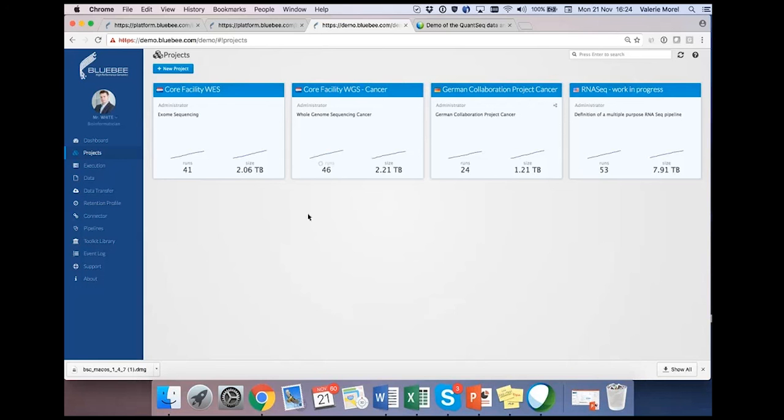Thank you, Michael. And the second question is, how long does the analysis take? And yeah, can you please also comment on this? Apparently it depends on the size of your input data, but usually in our test cases we had 10 to 20 minutes per sample, and since it's running in parallel, I would guess within 45 minutes the whole lane is analyzed.